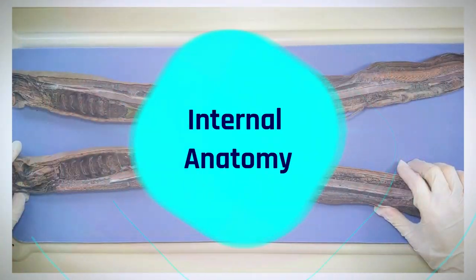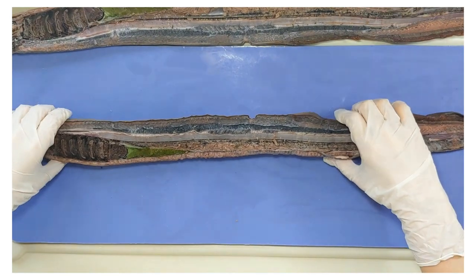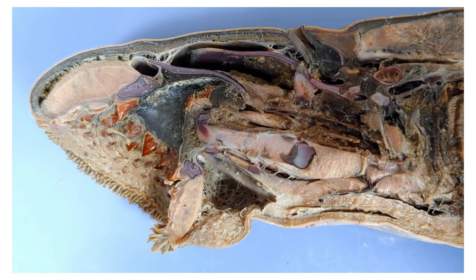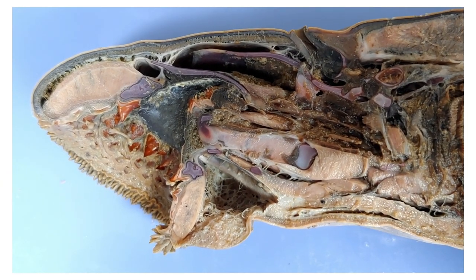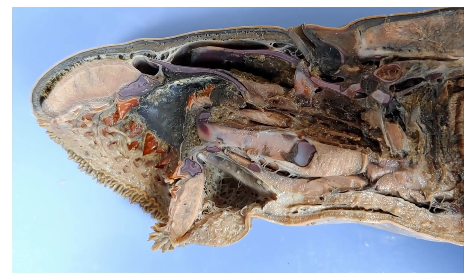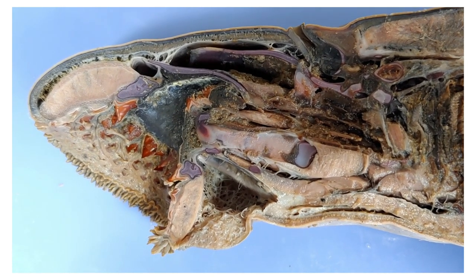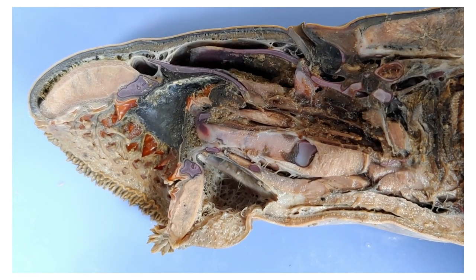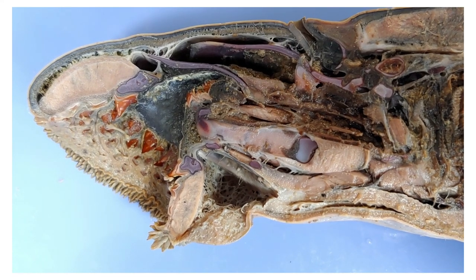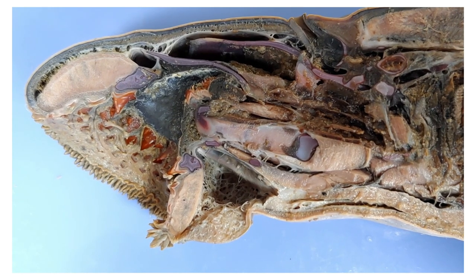Now let's take a look at the internal anatomy — I'll focus on this half because it's better preserved. The first thing we'll look at is the mouth. You should know that there are three kinds of lampreys: the flesh eaters, the blood suckers, and the ones that don't do much really. That last group spends up to seven years in a larval stage feeding on food particles suspended in water, and only lives six months as an adult, living solely off reserves acquired at the larval stage. The other two kinds are more interesting, and this lamprey is probably one of those.